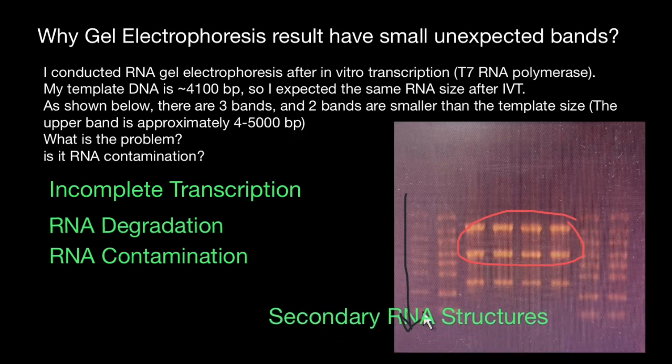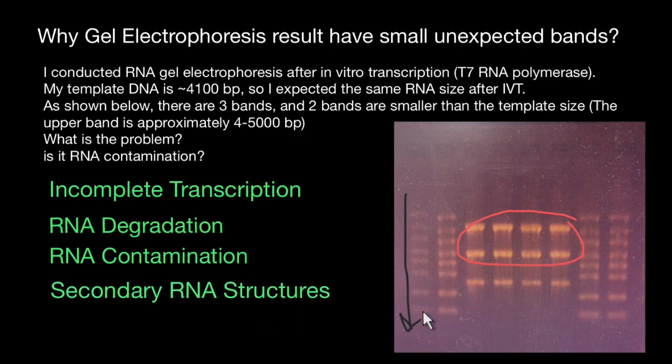Yet another reason can be secondary RNA structures. The formation of secondary structures within RNA molecules can affect the migration pattern during gel electrophoresis, leading to abnormal migration and the appearance of smaller bands. We can avoid this by denaturing the RNA samples by heating them before loading onto the gel, which can help disrupt secondary structures and improve band resolution.